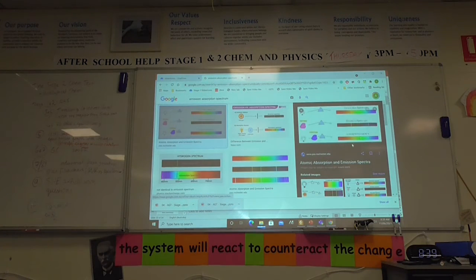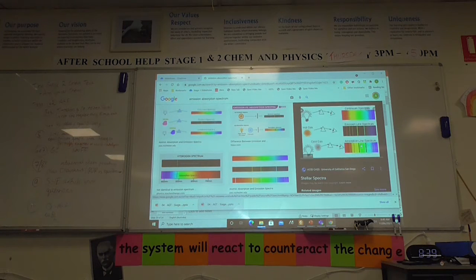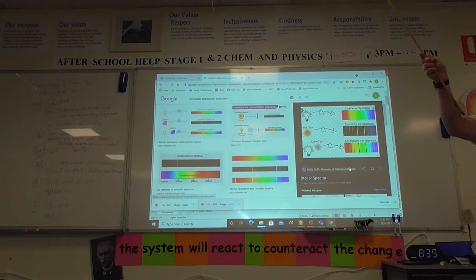Oh yeah, one of this classic image here. Maybe this one. Alright, you need something that's going to split the light up, okay? Because otherwise all you see is a colour. And you know for a fact that that's not white now. You know that that's a full-blown rainbow. And that's only what we can see. How about in non-visible spectrums?